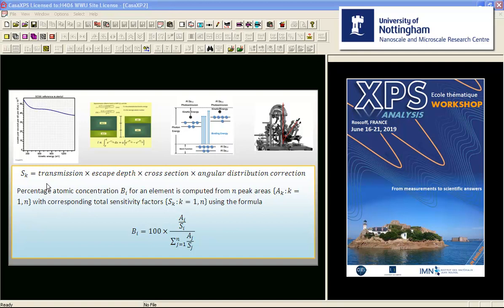Sensitivity factors measured using standard materials on a given instrument will necessarily include the transmission response of that instrument, as well as escape depth corrections, the cross section, and the angular distribution correction. So any sensitivity factors calculated in this way will only be applicable for this specific instrument.